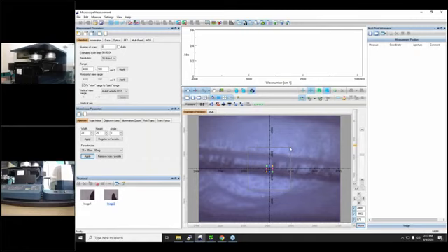So when the crystal is in contact with the sample, all the measurement is going to be performed in this area. For this we can also take images. So this is the image for my multi-layer sample, and this is a multi-layer polymeric sample.